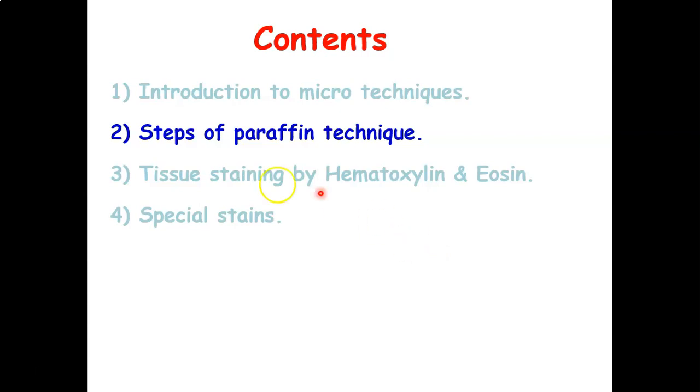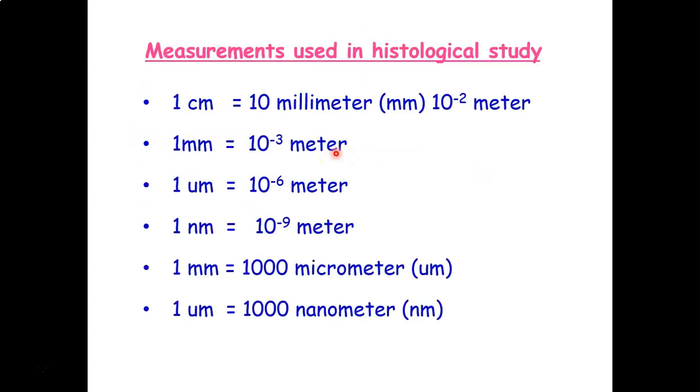Let's start with the steps of the paraffin technique. We have to start correctly, and the best start here is the measurements used in histological study.